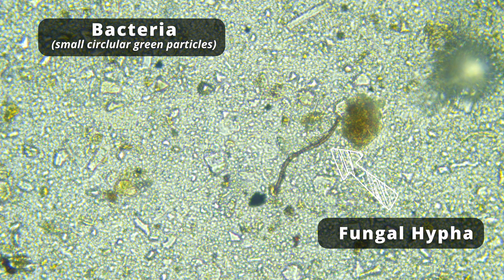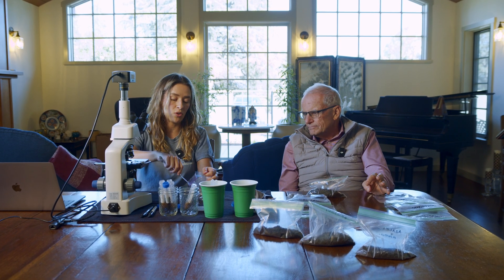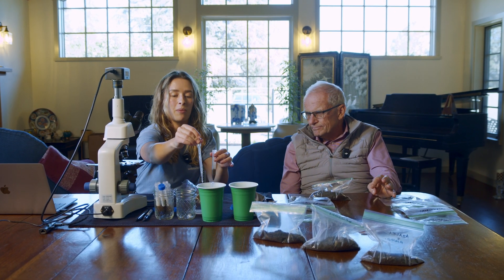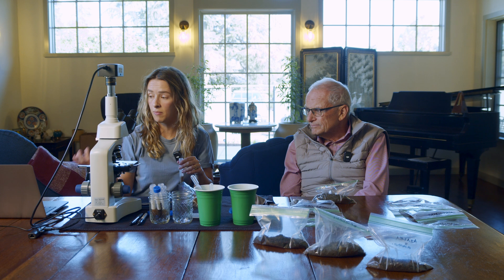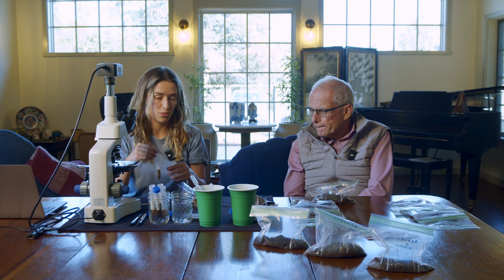It's a really good sign that we just found beneficial fungi. If you think about it, from all the soil out there, I took one dry milliliter — just a very small amount on this knife — and put it in here. Then from here we take a pipette, and only one droplet of water lands onto this slide. So if you're seeing beneficial things under that one droplet, it's really indicative of a lot of fungal hyphae activity. It's just the tiniest amount of soil, and that's pretty cool.